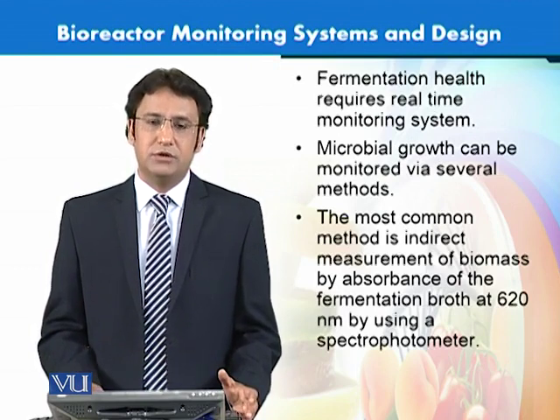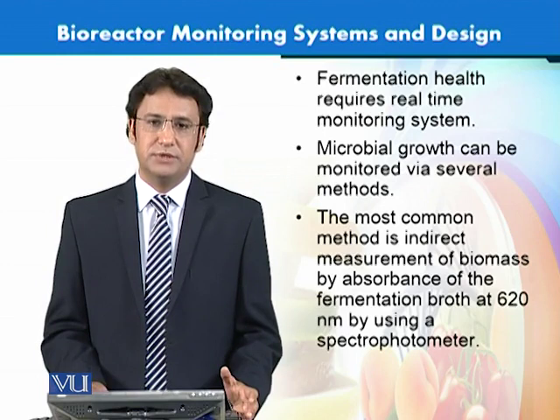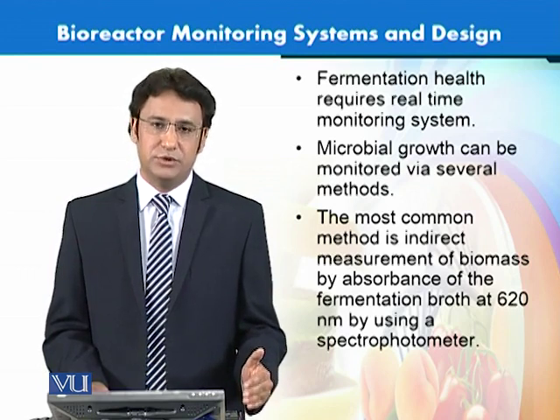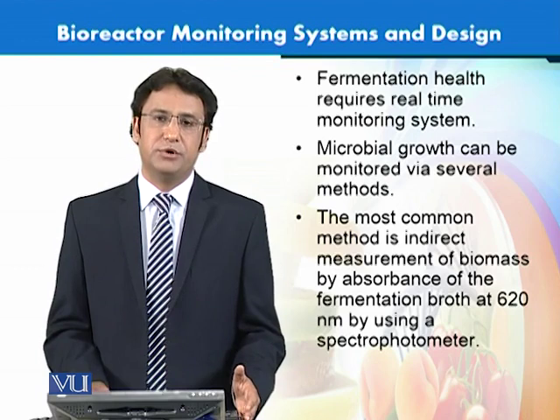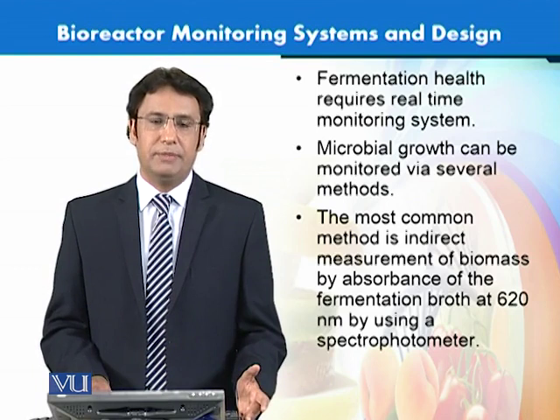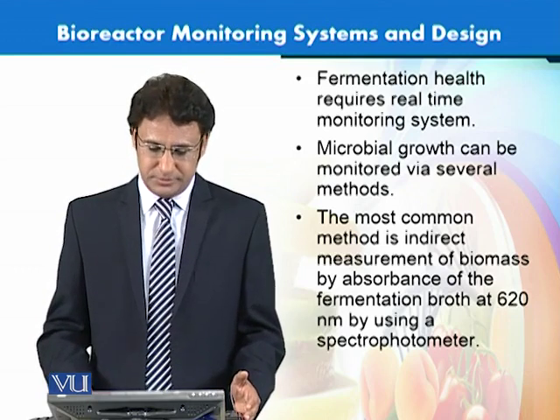We need to be able to look at the fermentation health in real time, and we should have a proper monitoring system to know whether the fermentation process is going smoothly, the health of the microorganisms is good enough, the production of different desirable metabolites is taking place, and their productivity is good enough. These are the things we have to monitor in all these bioreactors, and that can tell us about the efficiency of our bioreactor or fermentation process.